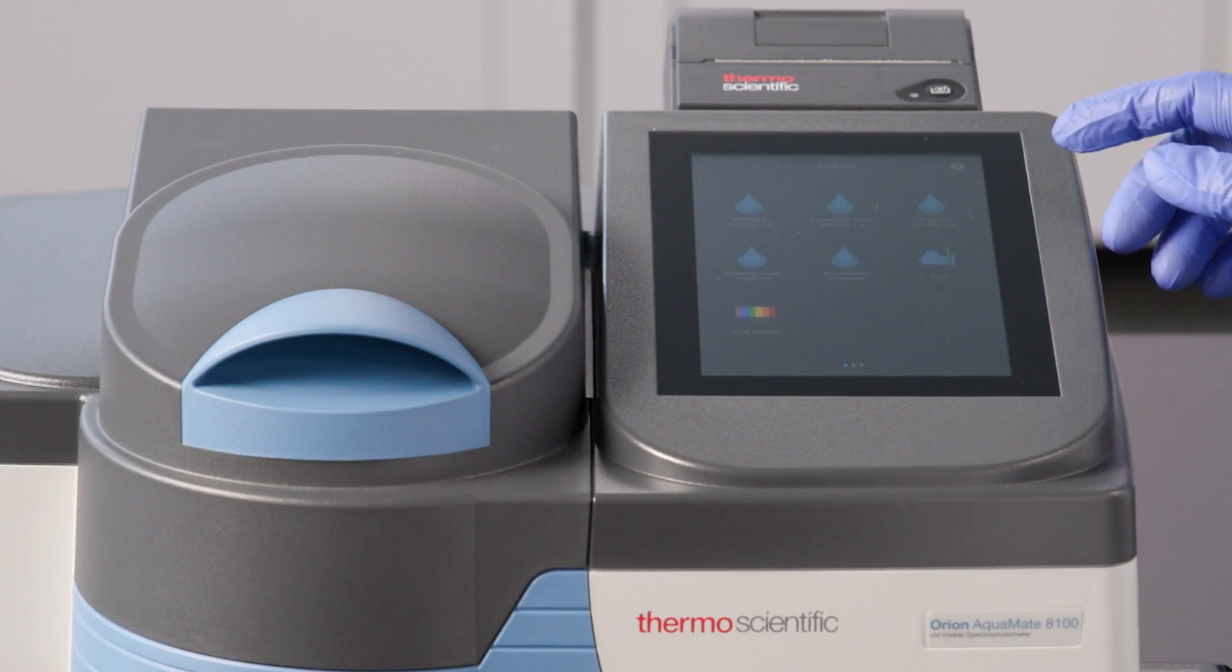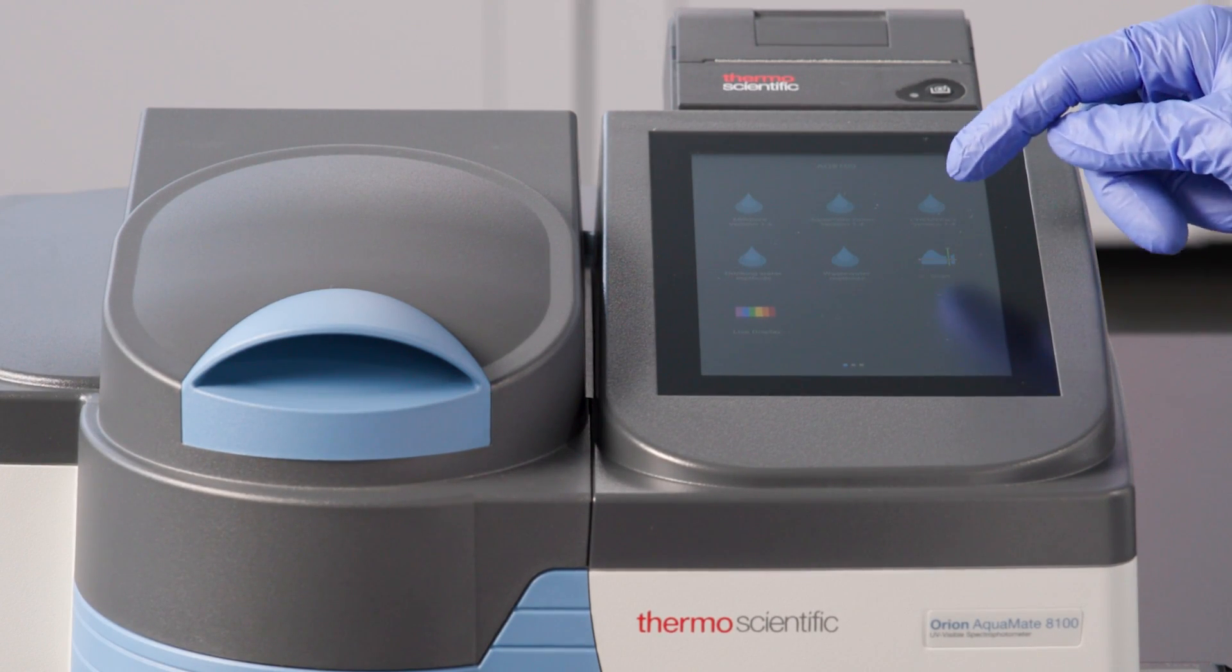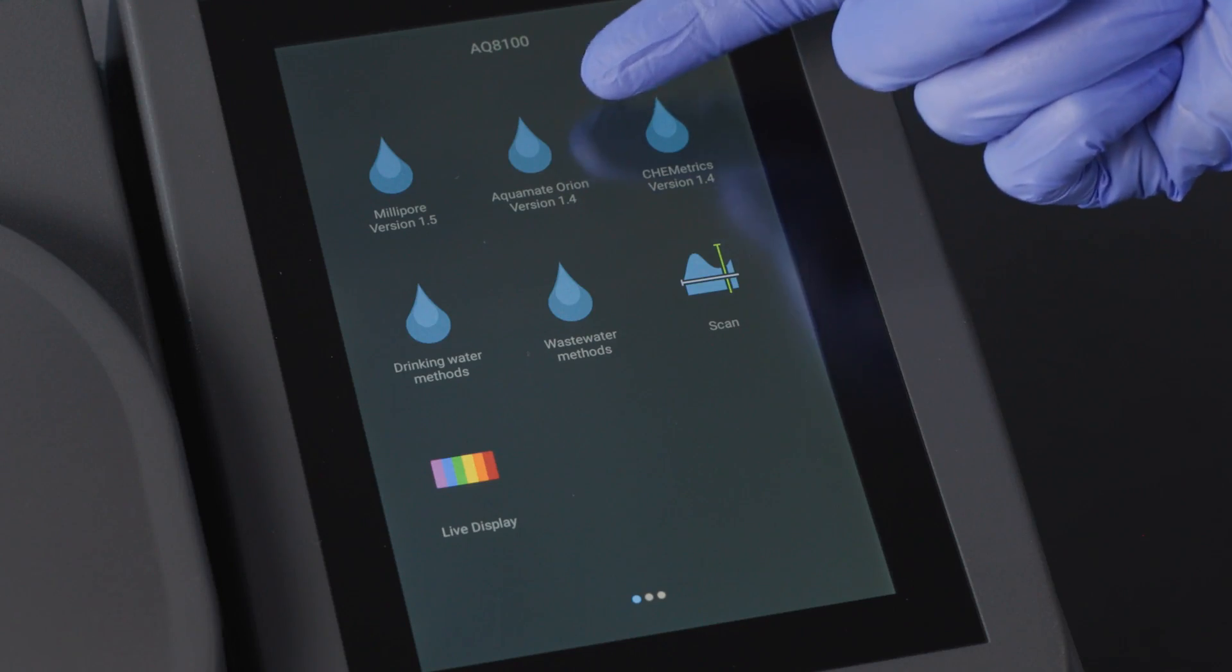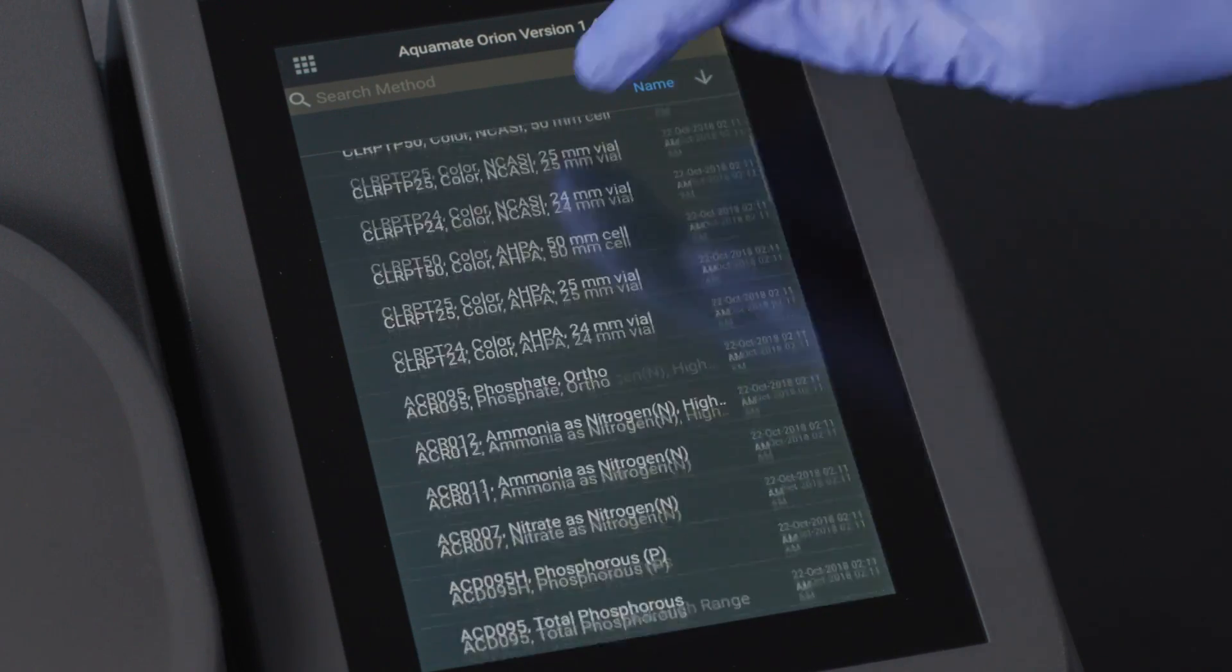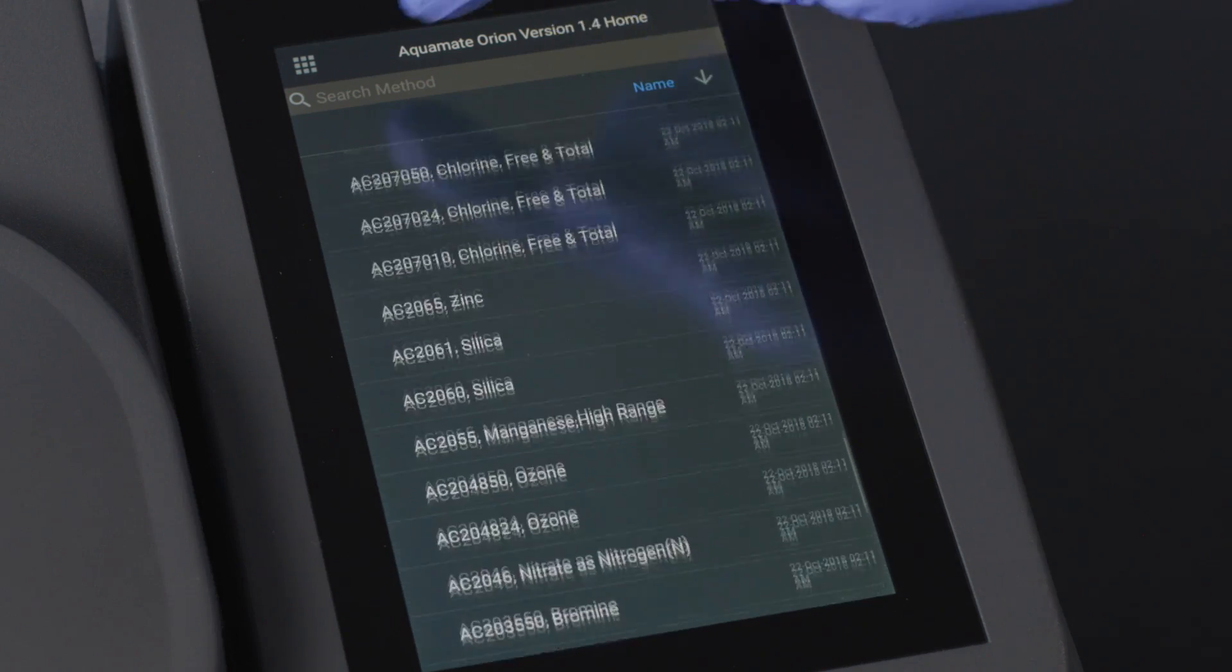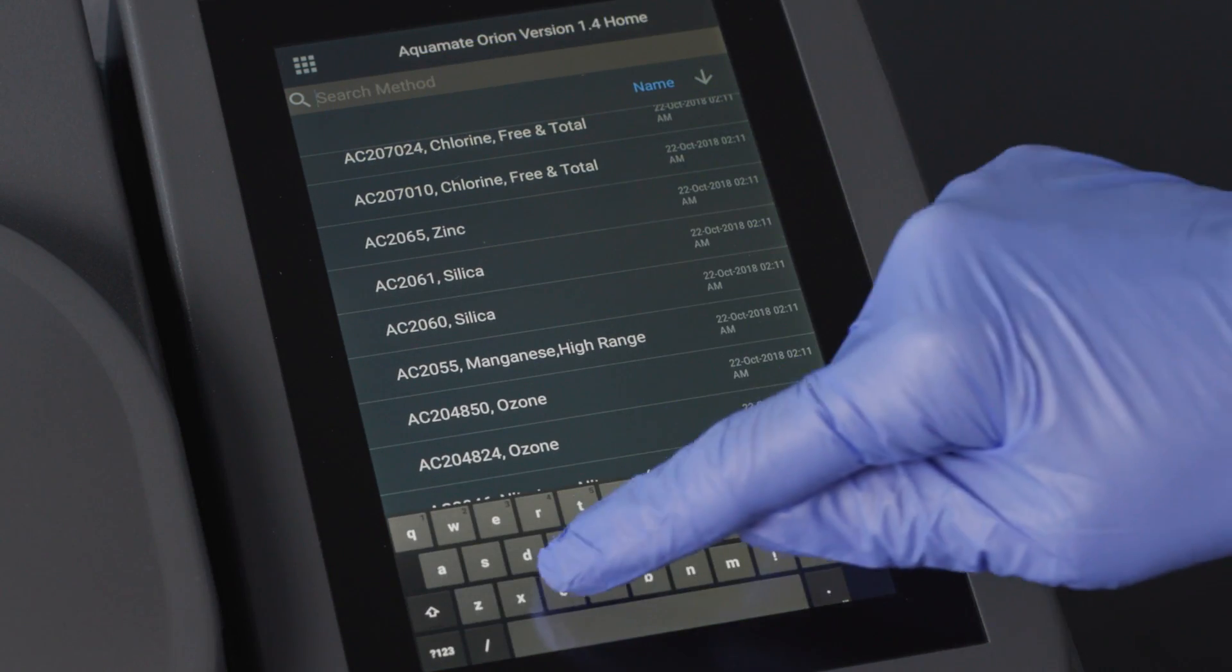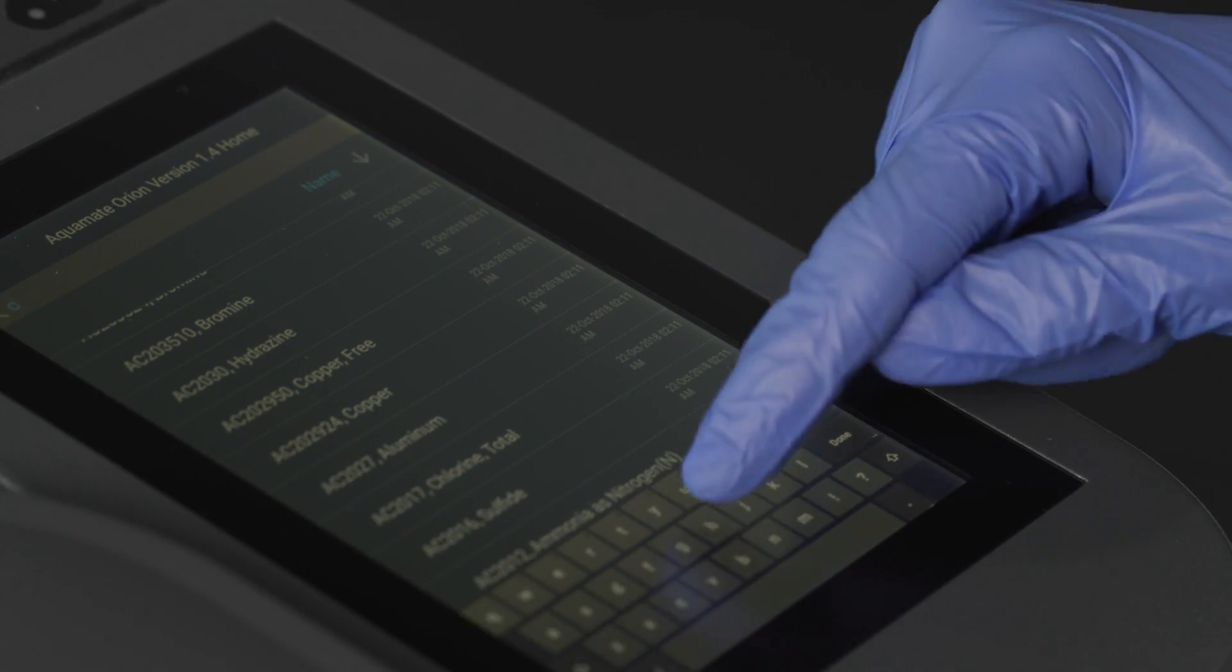We can access this preprogrammed method under the Orion Water Analysis Droplet menu. From here, we can either scroll through the available methods or we can select the search bar. When this keyboard pops up, I will enter chlorine as the search parameter.